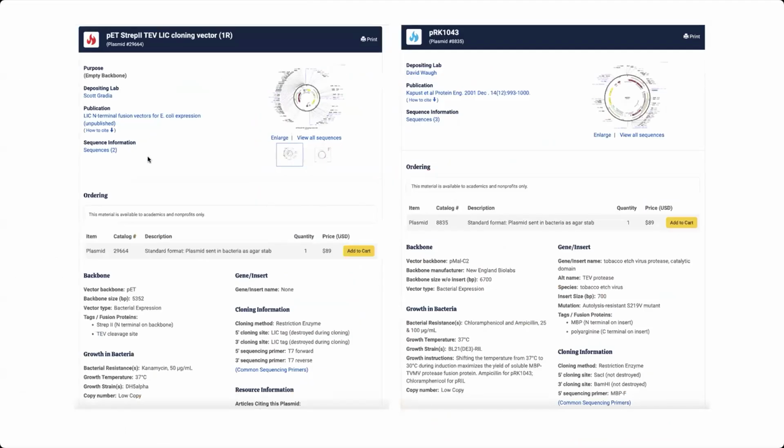So, for example, we have this cloning plasmid that we've ordered, and basically we're ordering a plasmid with a different tag so we can clone our gene into this plasmid. So we just care about the plasmid itself rather than protein made from the plasmid. And we see that this one is found in this DH5 alpha cell. So it's coming to us in these cloning cells.